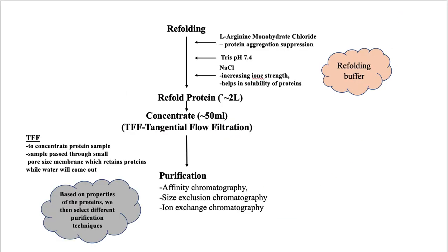Okay, so now how do we do the refolding of unfolded protein? Let me draw a figure for that. So if we have this beaker and we have around 2-liter refold buffer, and we have this small tube or a flask.